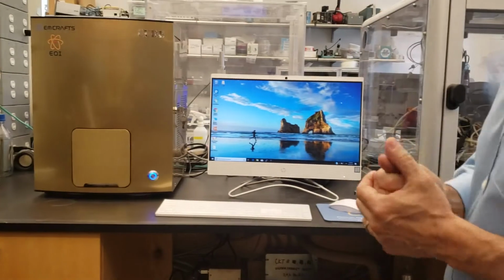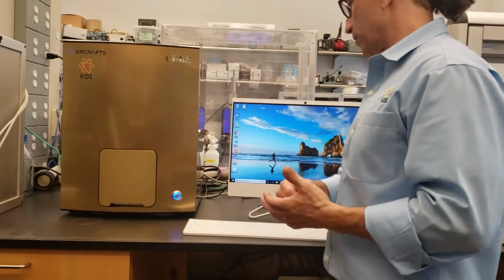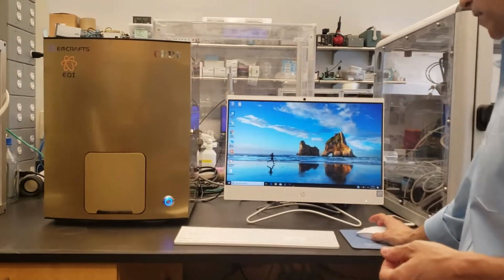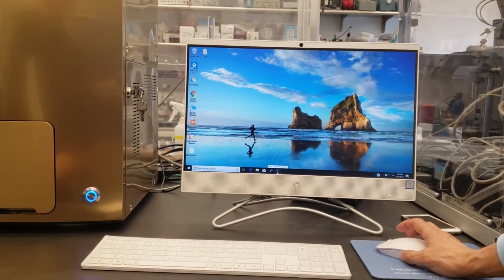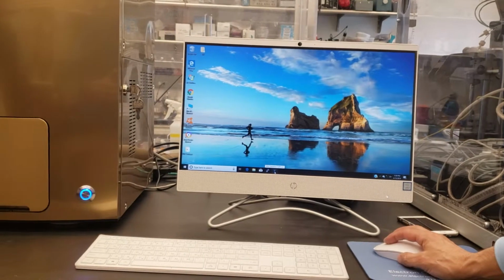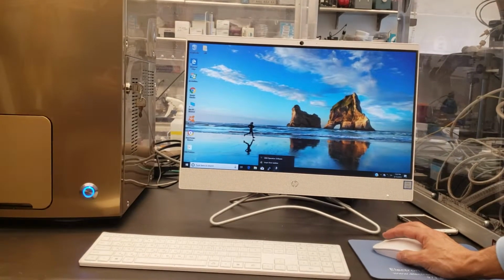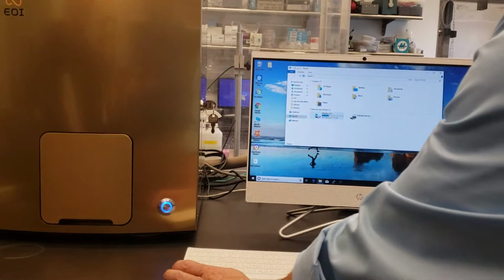Right? Here's your Windows PC. Great. So if you were to come in and turn power onto the cube, power's onto the cube, right? Great. The software bundle is located down here on your taskbar. Put it on the screen somewhere. We can put it up here too. Hang on. Let me go right click. Hang on. Make a copy there. Yes.